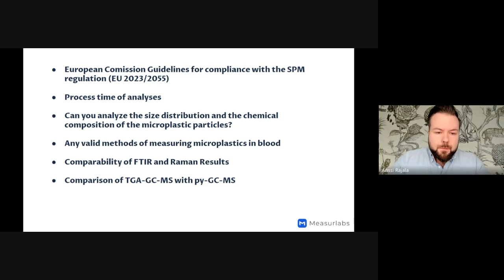Then there was also a question about nanoplastics. So the nanoplastics are basically analyzed in the thermoanalytical methods, but because the results are in mass and very small plastics have very small mass.